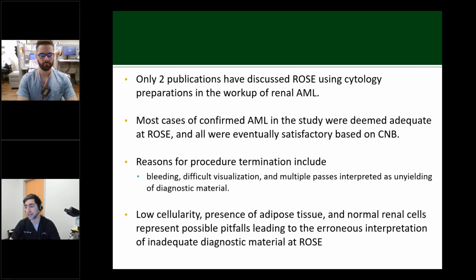However, there is only limited research specifically discussing the use of on-site evaluations that include cytologic preparations for the workup of renal angiomyolipoma. Existing publications lack specific information on site adequacy, diagnostic impressions, or triage decisions. And this study fills this gap by providing insights on the adequacy and diagnostic performance of touch prep of core needle biopsy when we're trying to diagnose angiomyolipoma.